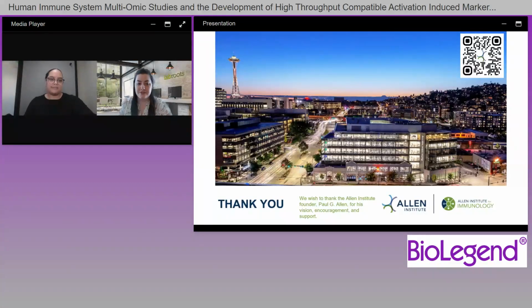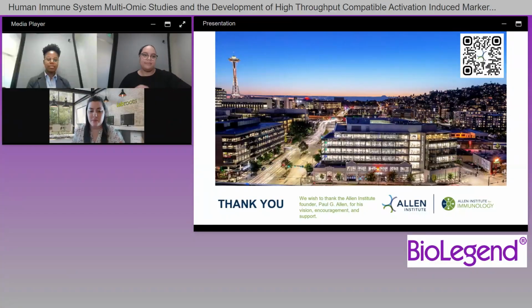Our first question asks, what is one of the main challenges that you had when developing the panel for this platform? Yeah, so I'll take a stab at that. Unlike traditional flow cytometry, we have exposure times to deal with rather than gain settings. So that was a little bit of a challenge.